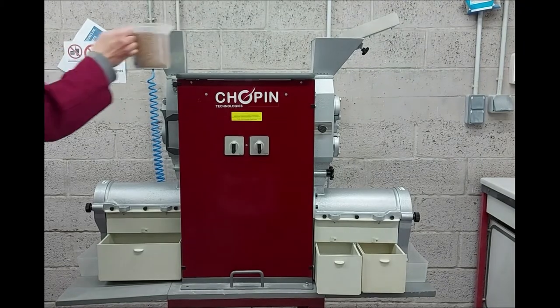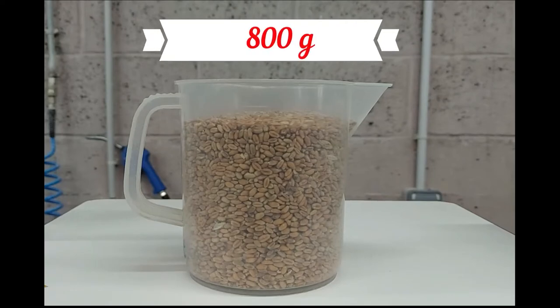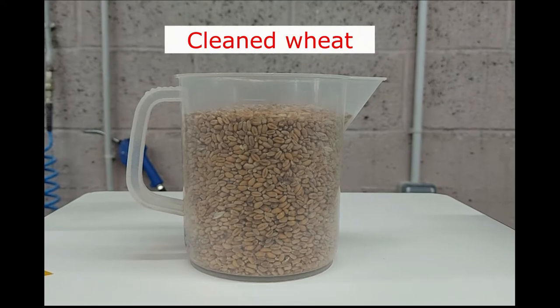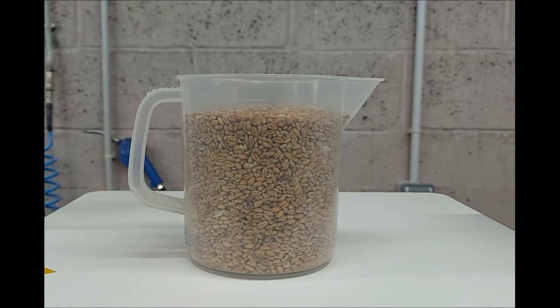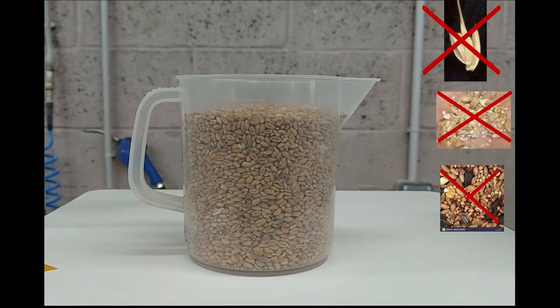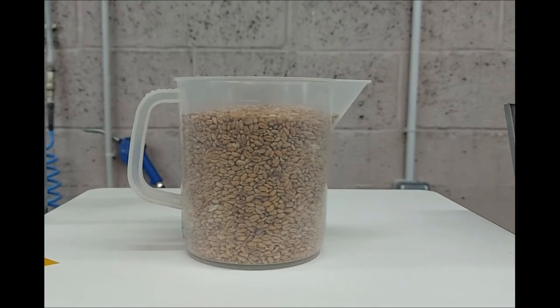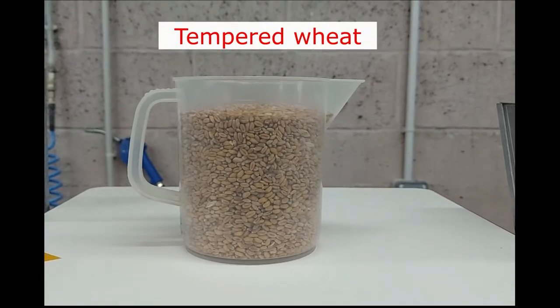In order to run a test you must have a sample of wheat, typically 800 grams. This wheat must first have been cleaned — that is to say, free of all foreign bodies liable to alter the quality of the milling or to damage the instruments, such as stones and metallic parts.